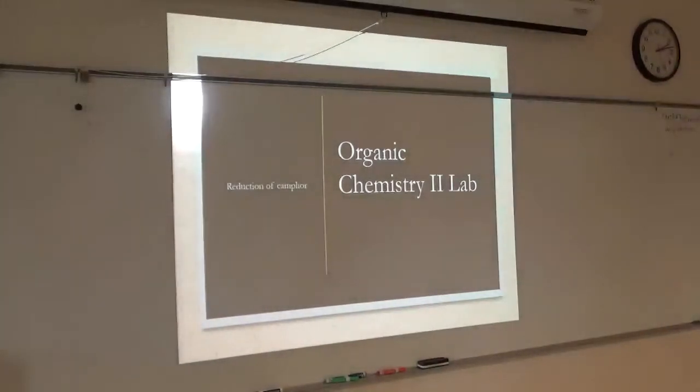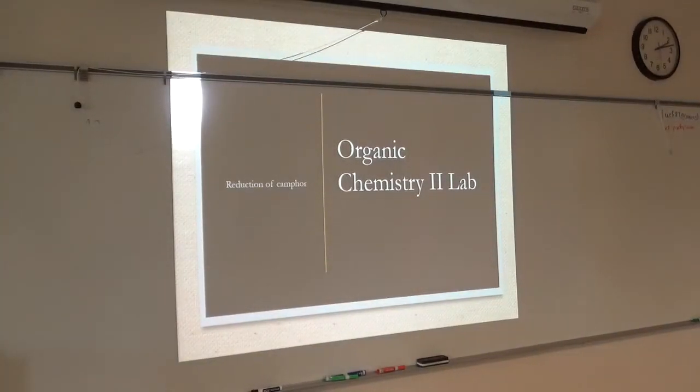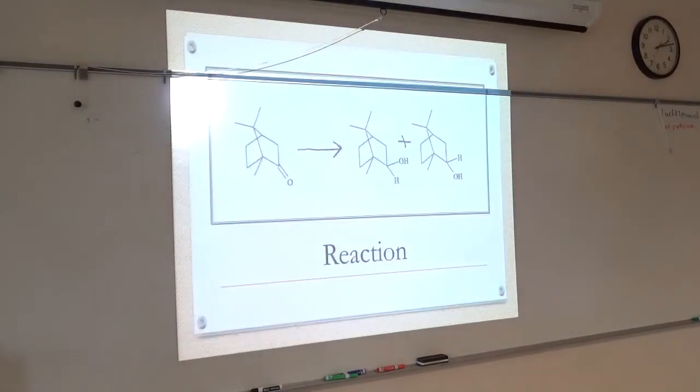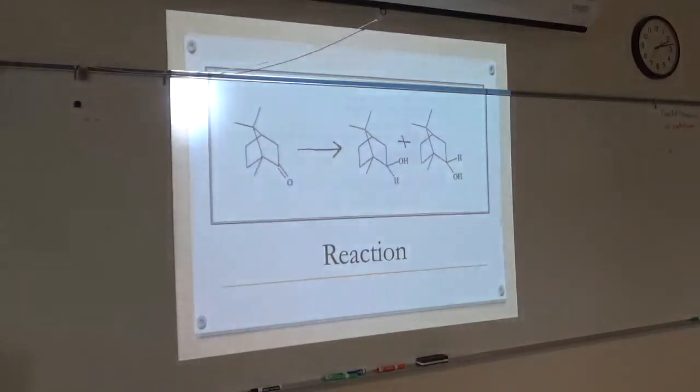Today, the reduction of camphor, a ketone, by sodium borohydride into borneol and isoborneol alcohols of varying stereochemistry. You will not be responsible for the mechanism for this reaction, but given a ketone, such as camphor or some other ketone, be able to determine the product of the reduction to the alcohol.